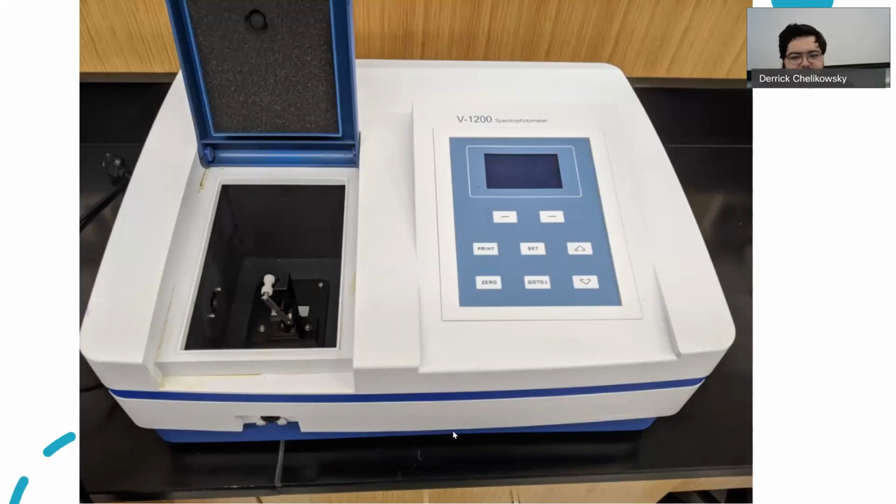Oh, it's good. At the risk of sounding like a really old person when I'm really not, back in my day, again, at the risk of sounding like that, I didn't use one of these. I used a really cool piece of old tech called a Spec 20, which was from 1959. And it was a gorgeous piece of old technology. And it worked. But these are so much nicer compared to those.